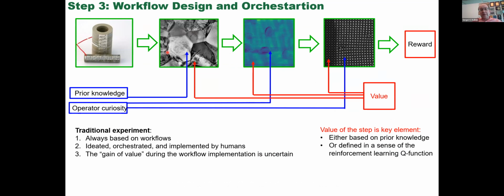So if I take the microstructural measurement with the optical microscope, what is the added value of the scanning probe or electron microscopy in terms of my understanding of the physics of this specific system? This is a really exciting area, but we always have to explain what the value of these advanced tools is, what value they bring to the scientific world. Typically, it is very speculative. We need to understand physics. Maybe we can put a little bit more definitive answer to this issue. So I think machine learning can actually allow us to do that.